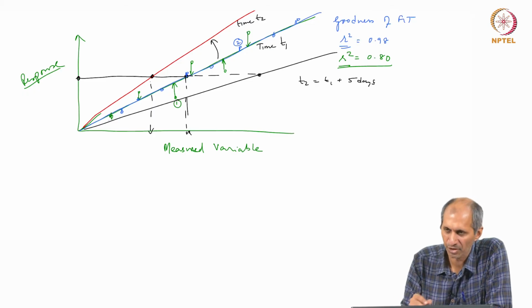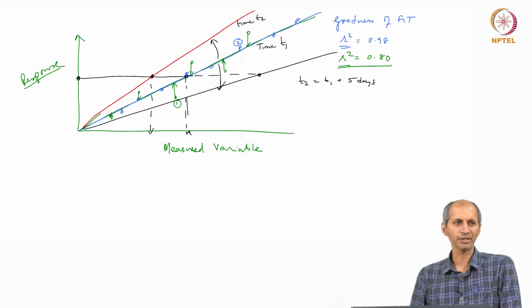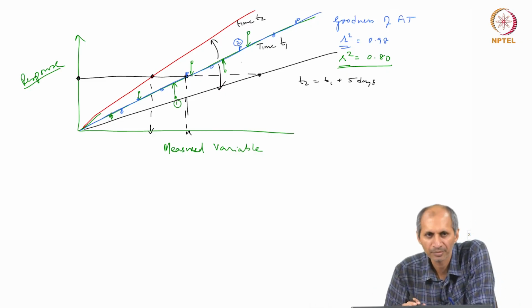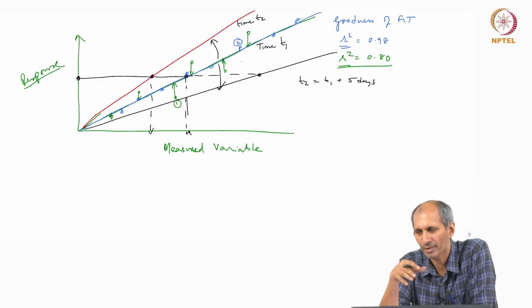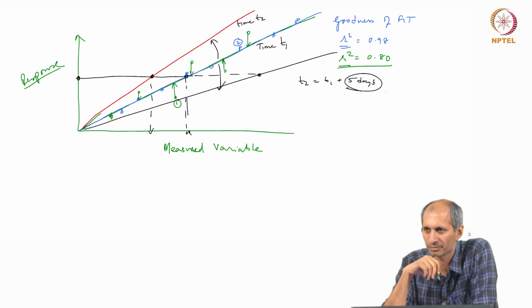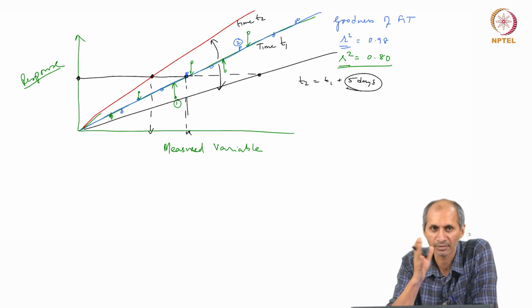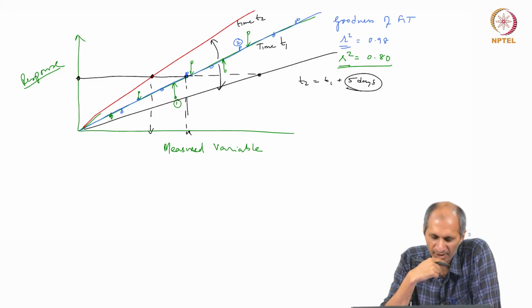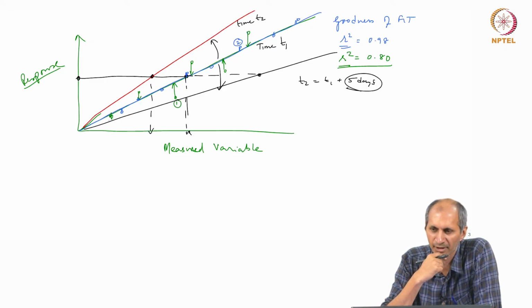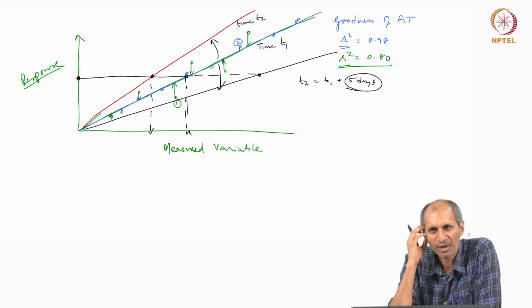If the calibration changes, it means that something is wrong with the instrument's response to the standard. This happens in a lot of instruments. Five days is too short, but this can happen in some instruments where over a period of 1 or 2 days it will change, okay, because of the way the instruments measure, a lot of these artifacts appear. So, the standards are a very good way of checking.